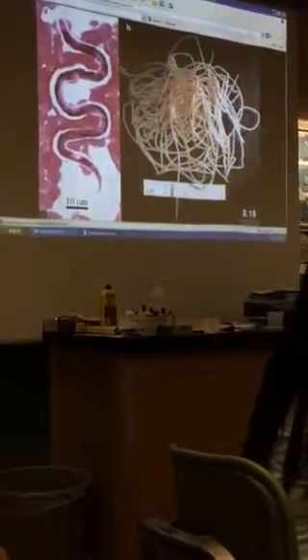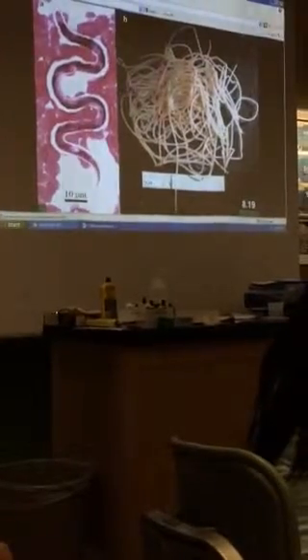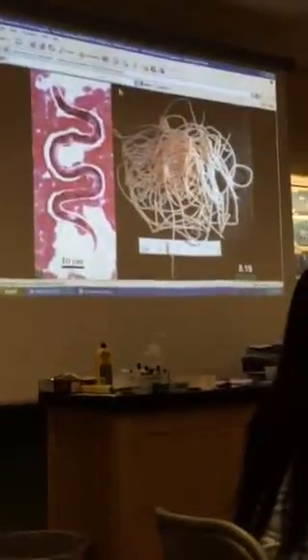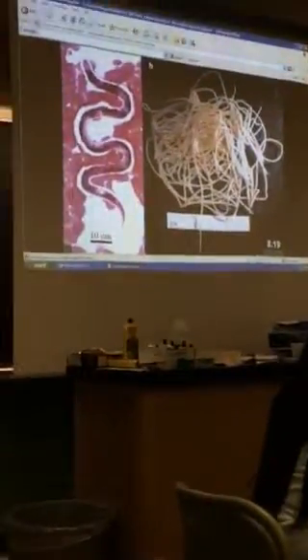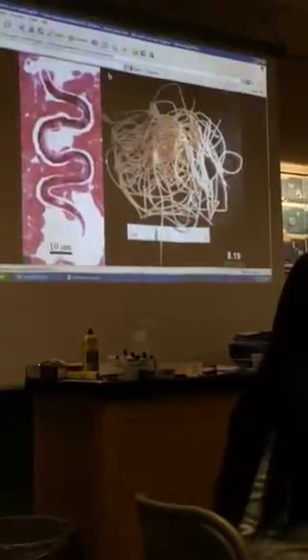They're pretty small. This is some red blood cells. So we have some new slides of Dirofilaria immitis. They're blue. We had only one good slide before, with one microfilaria on it, but I think we're probably in better shape now. So make sure you recognize that. All you have to do is recognize the stage. I know that this is Dirofilaria, and you know that too, but the other members of this group also produce that stage. So recognize that as a microfilaria.